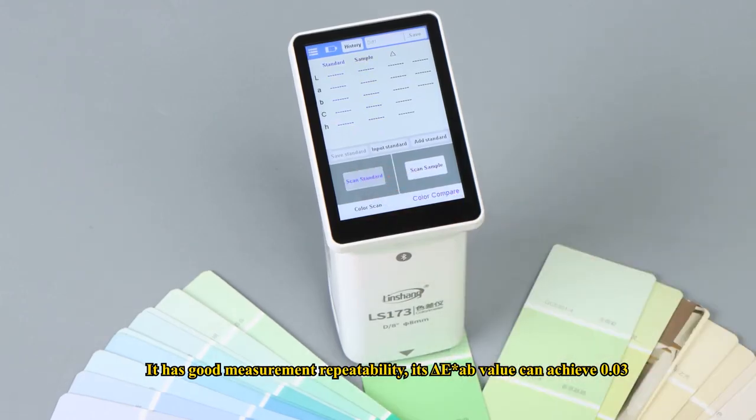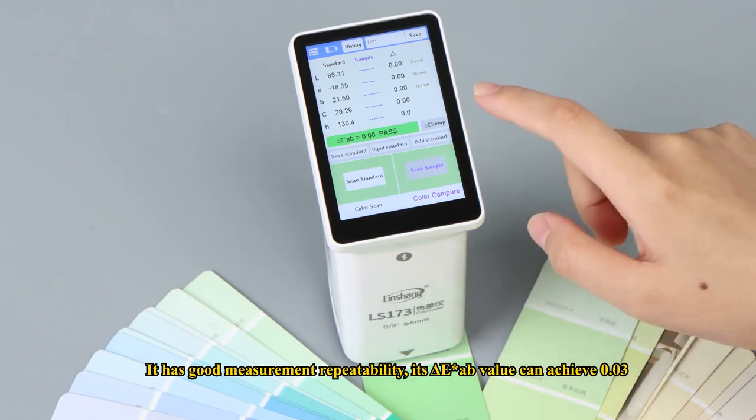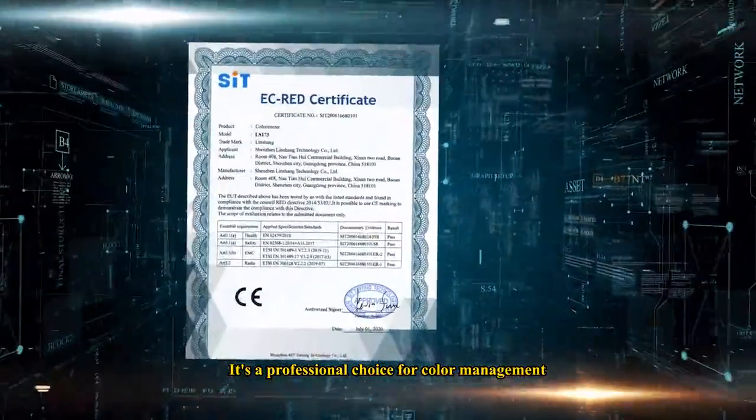The LS-173 has good measurement repeatability — its delta E* value can achieve 0.03. It is guaranteed to pass the inspection of an authoritative metrology institute. It's a professional choice for color management.